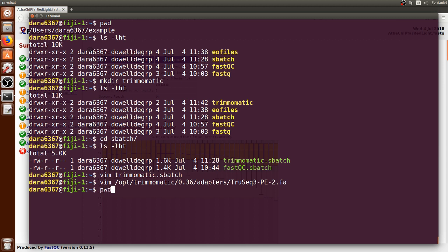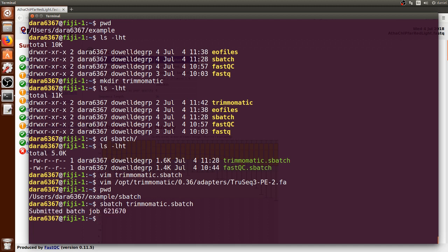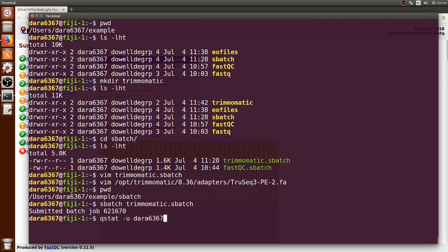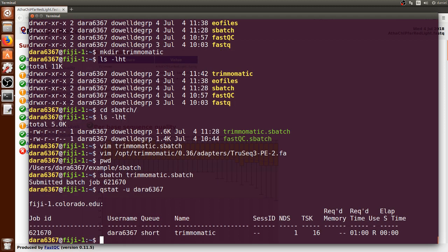We can just exit it and run that sbatch file by writing sbatch space and the name of the sbatch file. We can use tab to autocomplete and press enter. We have the job ID of that job that we just submitted.